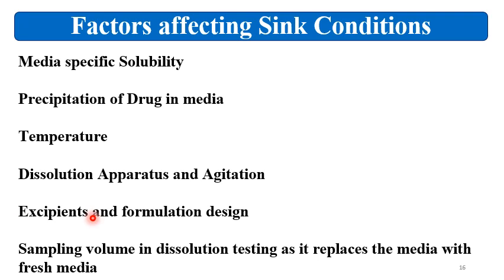Now, excipients and the formulation design also have a great impact on the sink conditions. Sampling volume in the dissolution testing is an important parameter which affects the sink condition, because it replaces the media with the fresh media.